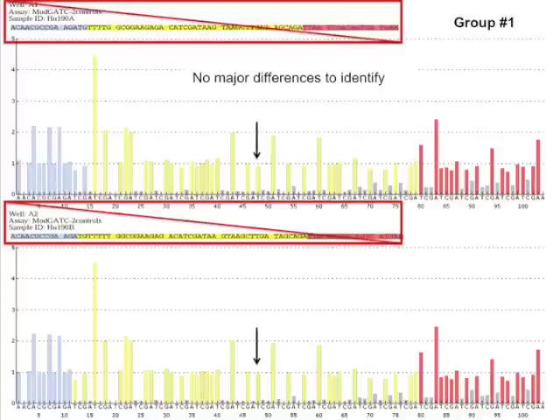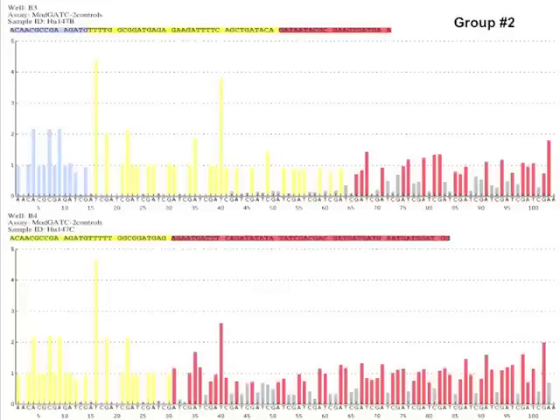If we look at our next group, group number 2 here, again we have 2 pyroprints from the exact same isolate, human 147. And if we start looking for differences, let's look here at dispensation 16. We dispensed a T at this particular dispensation, and the machine called out just above 4 nucleotides, 4 Ts, for this particular location.